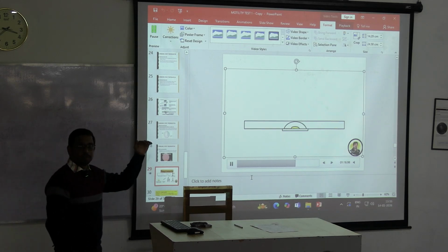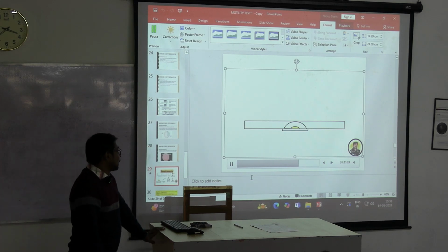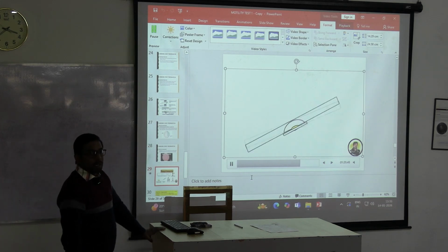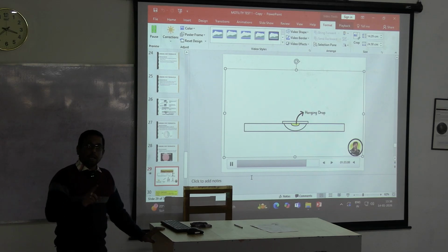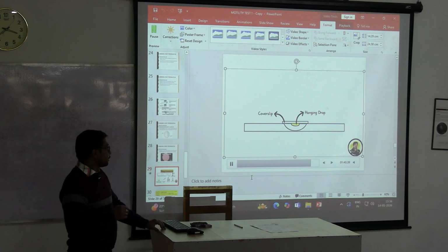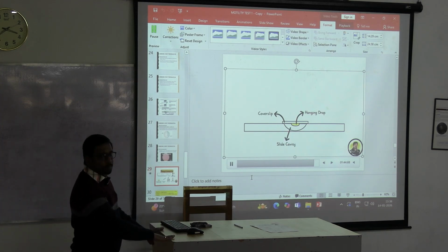After that we invert it, take it to the microscope and focus it, at first with 10x, focusing on the edge of the drop, then 40x. This kind of appearance should be there.